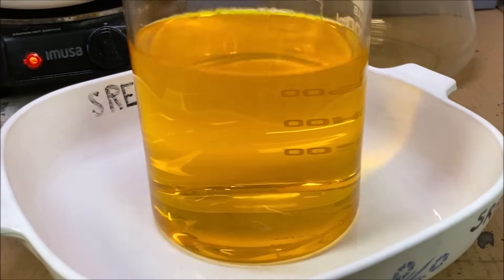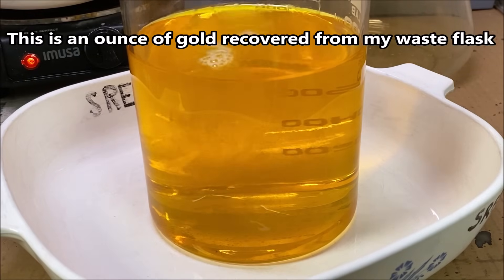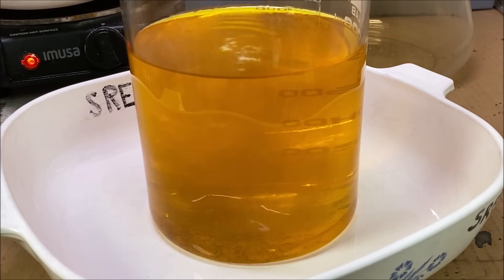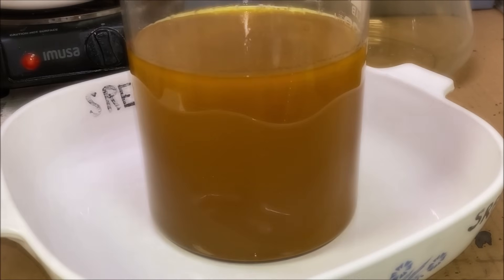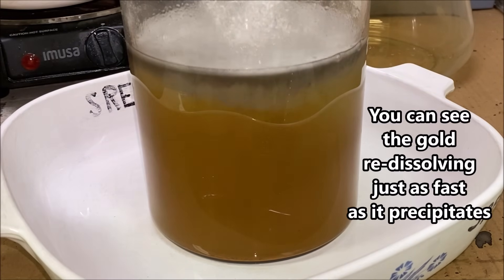Here's our first bit of SMB going in right now, putting it in little spurts, a little bit at a time. I'm going to add some more SMB here to get the rest of the gold to come out of solution and precipitate out.